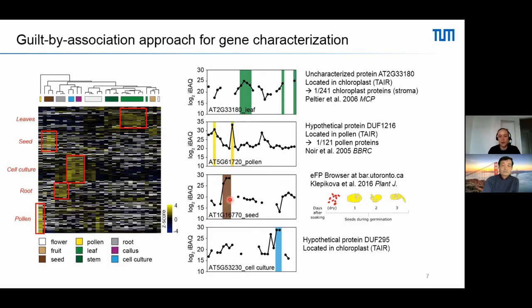Here the protein is assigned as a seed proteome protein sample. We also find information that this was already reported as seed localized on the transcriptome level. However, now we can also add the proteome level information. But we also have cases where the annotation does not agree.